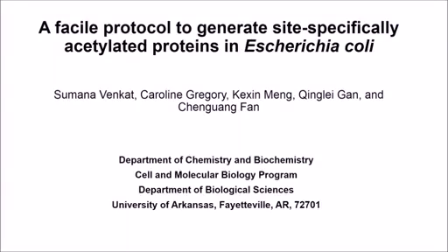In this work, we will demonstrate a facile protocol to produce homogeneously acetylated proteins at specific sites by using E. coli as the expression host.